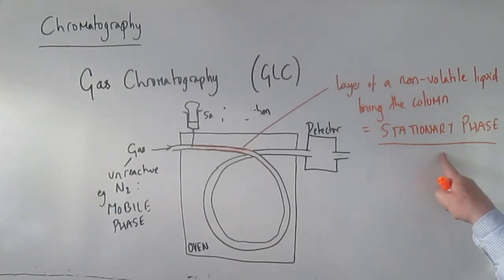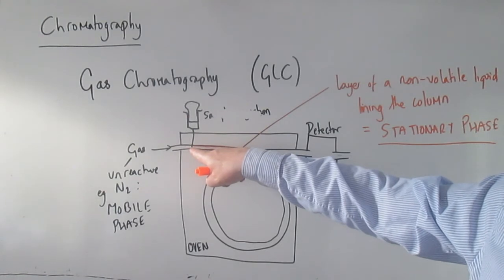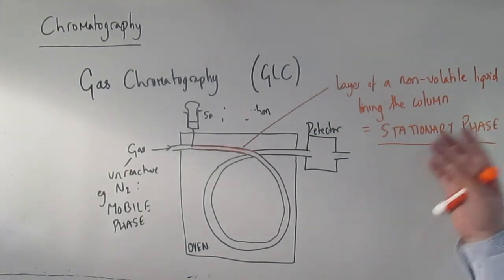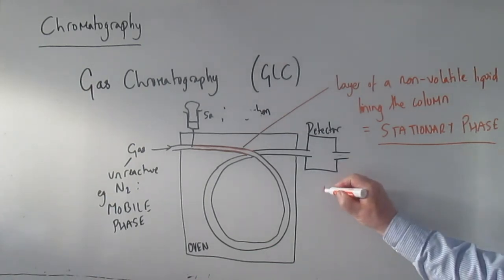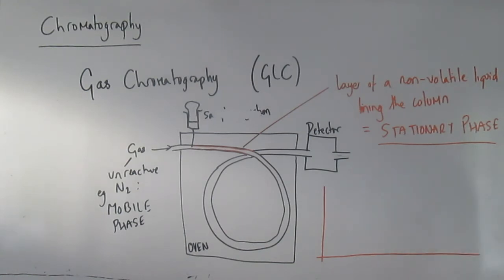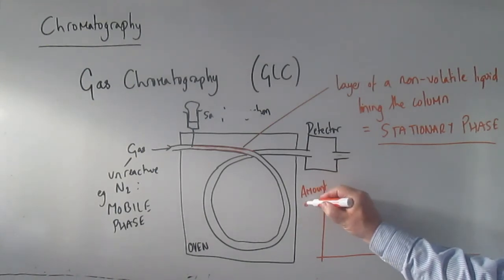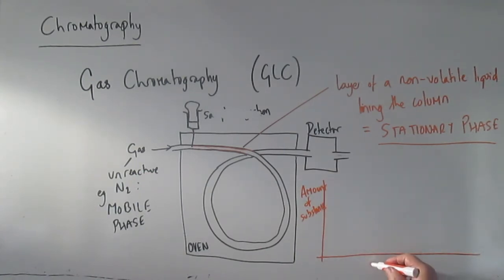So that's our stationary phase, that's our mobile phase, and what it means is that while the substances are all introduced into the column at the same time, they will reach the other end at different times. And we have a detector. You don't need to know anything about how the detector works, but the detector can tell when different substances arrive at the end point. So what you end up with is a gas chromatogram, which is a kind of graph that looks like this, where in effect this is amount of substance on the y-axis, and this is time, and specifically we call it the retention time.